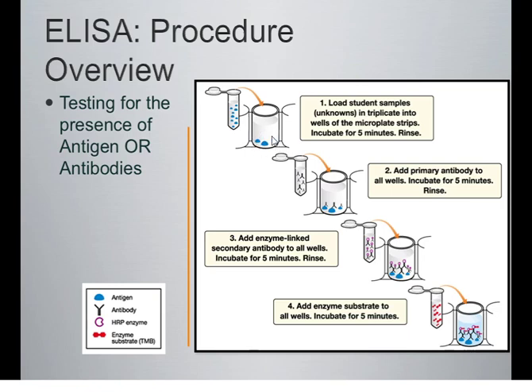And the reason for that is that if you don't do that between this step and that step, when you put the primary antibodies into the next step, if there's any space left on the plastic, these primary antibodies will actually bind to it indiscriminately. What will you end up with? You'll end up with a false positive, right? In some cases, if you don't do that with the negative controls and the antibody binds to the plastic without any antigen, then you get someone showing up with a positive result and you're like, oh yeah, you've got the virus, when they don't. And that can change a number of different things.